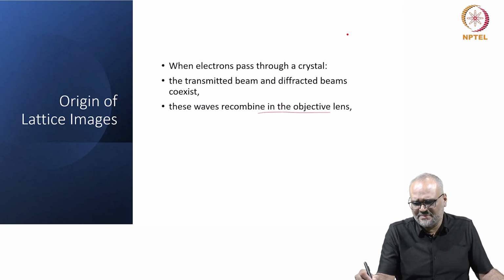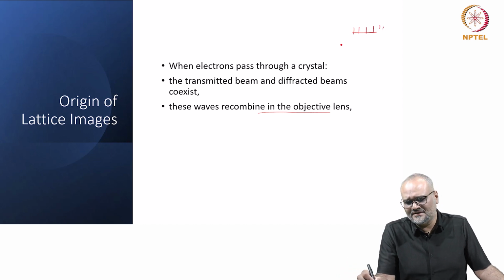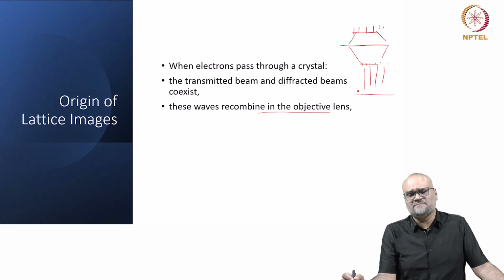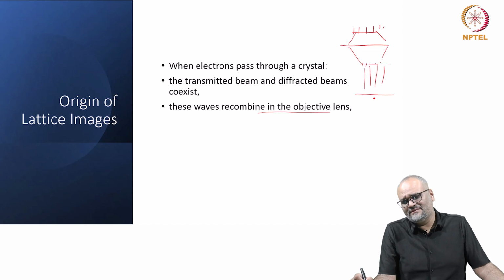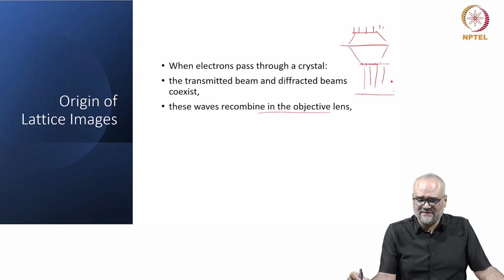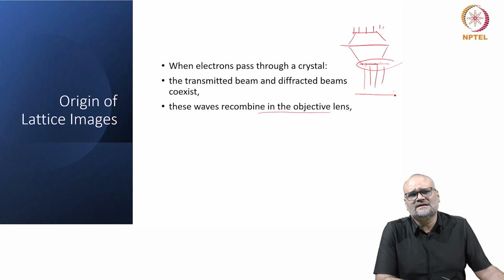So, if I think of the previous diagram that was shown, I have the exit wave, sort of a planar wavefront, going through the objective lens. It recombines at the back focal plane, and then this propagates forward, and when I record on the image plane, these waves going through the objective lens are interfering and form some kind of periodic spot pattern at the back focal plane, and from these you have a reconstruction and you get the inverse Fourier transform of this information at the image plane. This was already introduced when I told you the concept of a lens.